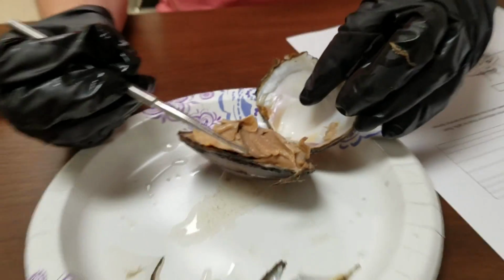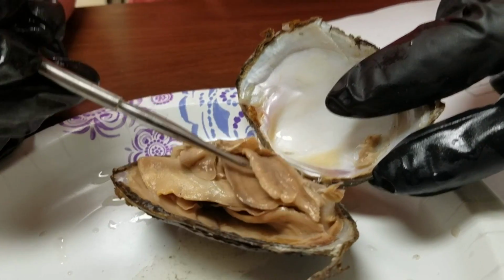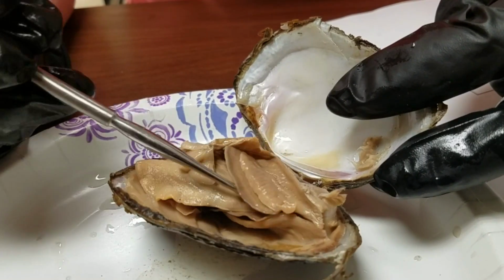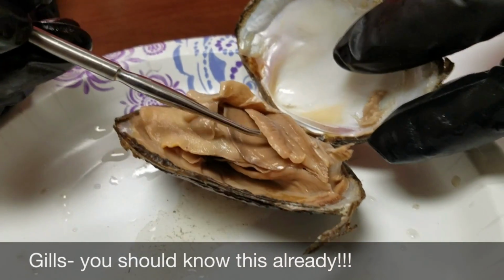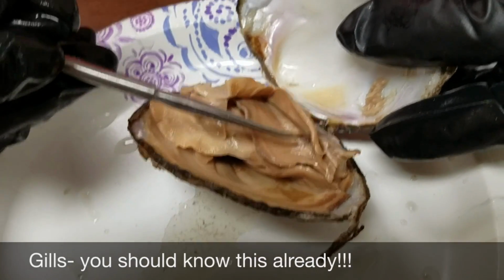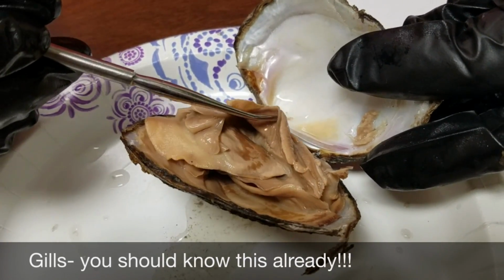Okay, so if you look inside your clam, you're going to be able to see these flap things. They're not feathery like in the fish, but this is what your gills are. So you have your gills here. All right, so these are gills. They're kind of striated. They have stripes on them. It exchanges oxygen and carbon dioxide for the clam.